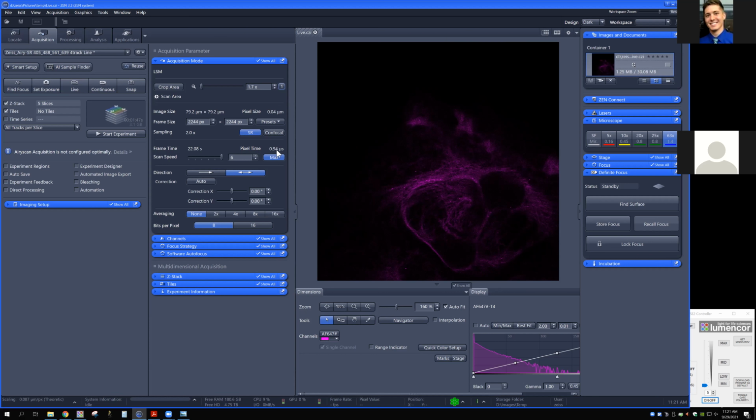And I guess as we're talking about zoom, the other thing that I'll mention is that when you're doing Airyscan, the zoom is going to be one of the best ways that you can speed up your imaging. And the reason why I say that is because if you remember yesterday, we talked about this confocal button, and I said, I always use it for confocal. I use it in 4 steps. I hit the button, I laugh, I cry, and then I downsample. And that's how we always save time when we want to save time with confocal. In super res mode, you want to adhere to this, so I don't have the luxury of trying to downsample the way that I would normally.